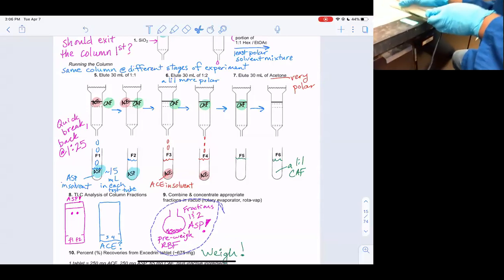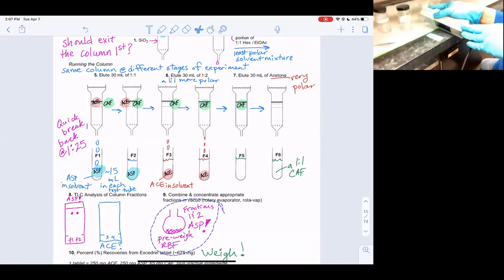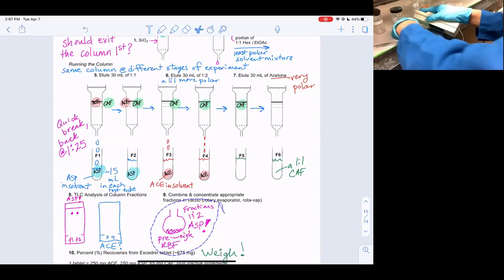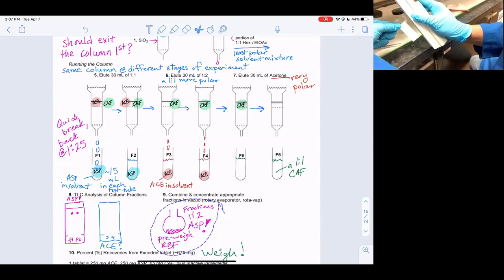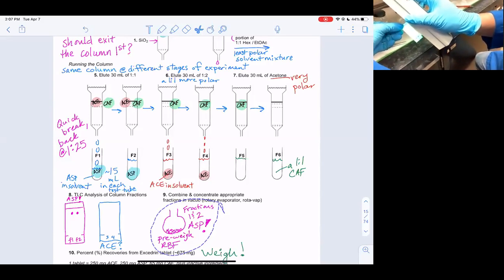Going closer to you to see it better. It's actually too close, I think. If you're not on that surface, you really can't see it. Ooh, there you go. You have to shine it directly. See how you're at an angle right now, Richard? You need to get it parallel on top. Now we can kind of see the spots on the bottom.